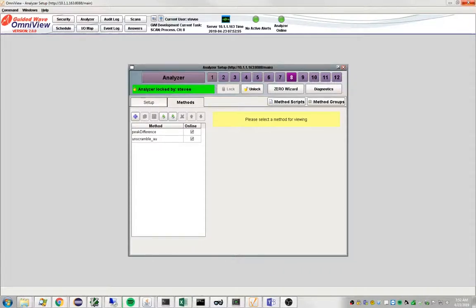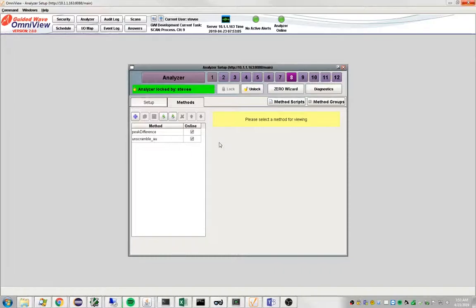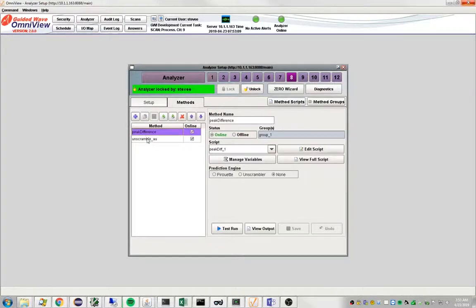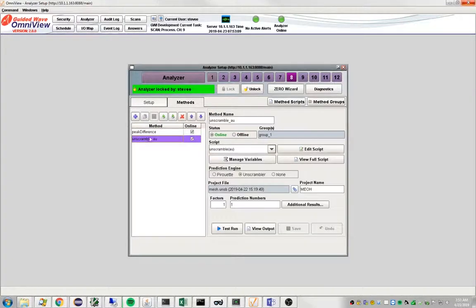This is part six in a series of videos showing how to create and use methods in Omniview. In previous videos I've shown how to create these two methods here, and I've shown how to copy them over to another channel.